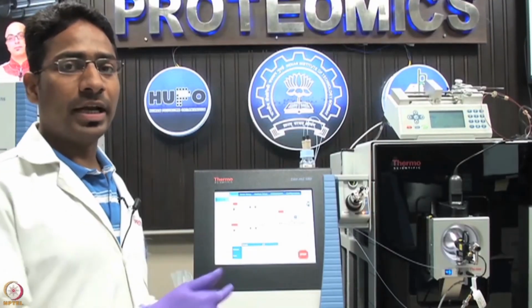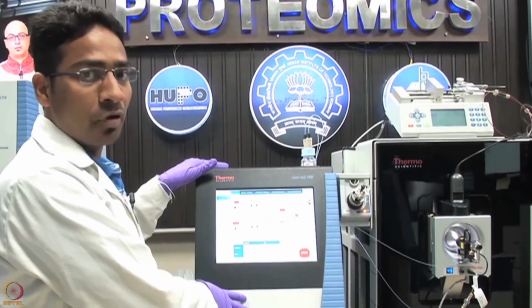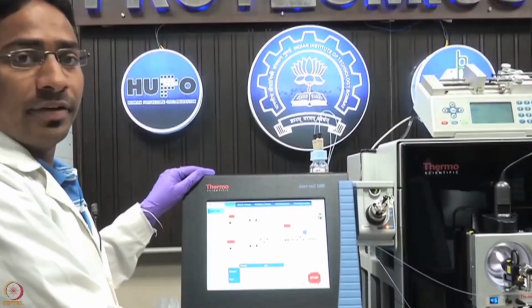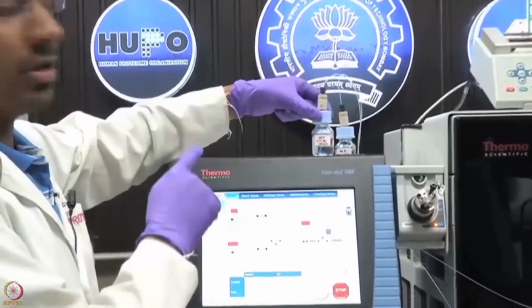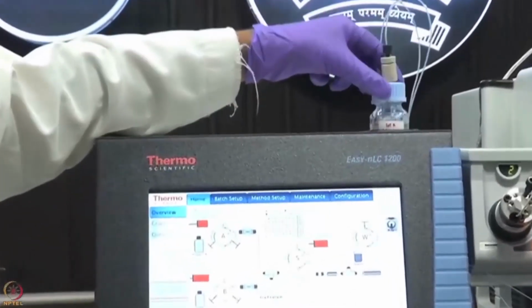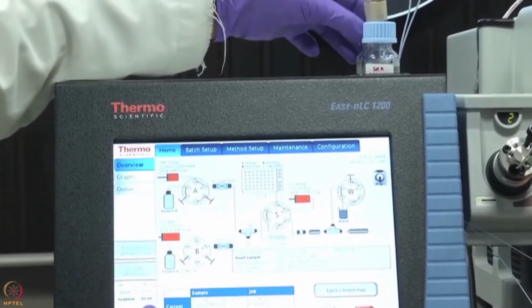Hello. So, here I am going to explain about mass spectrometry. Basically there are two main components, one is liquid chromatography and the other is mass spectrometry. I am going to explain first about liquid chromatography. Here you can see there are two main solvents: solvent A, which has 0.1% formic acid, and solvent B, which is 80% ACN in 0.1% formic acid.